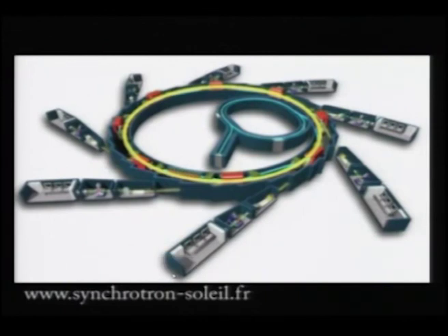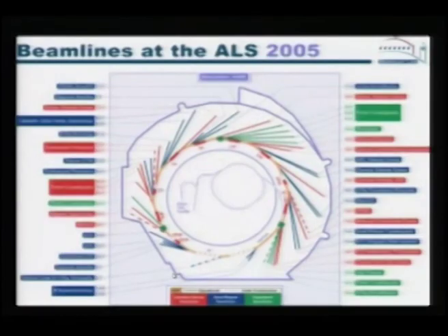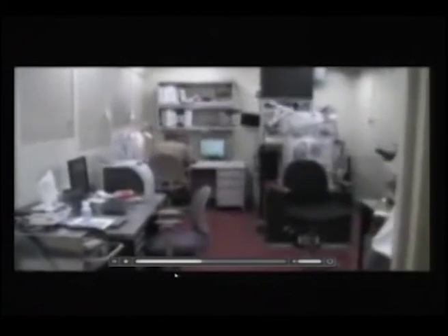Here the yellow line signifies that the high energy X-rays are diverted to many places, and we can also see how this can be used in different substations. And these are the many beam lines that we see in this Advanced Light Source. A typical substation will have a lab like the one we see here.